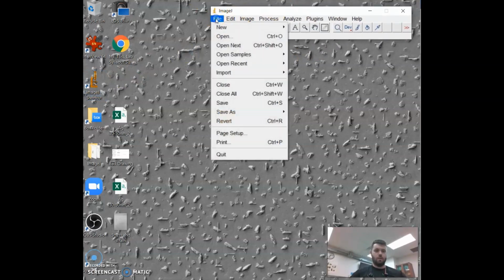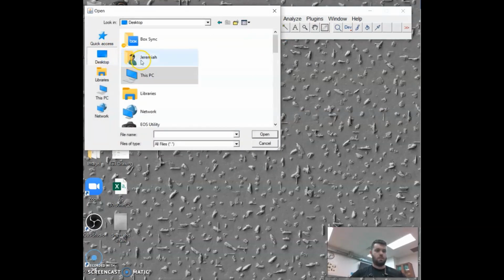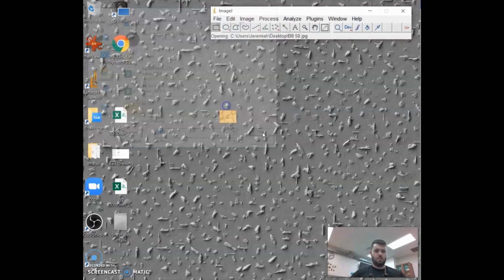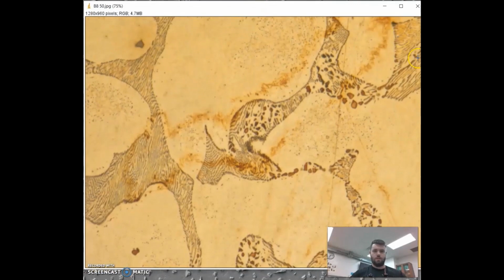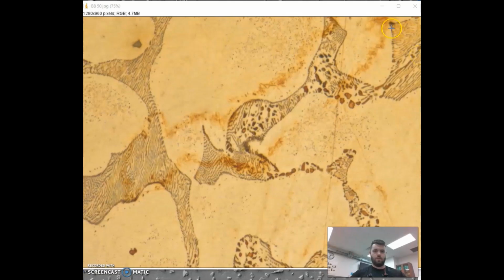And what we're going to do is open that file. So B850. This is the file. Hopefully it fits on screen.